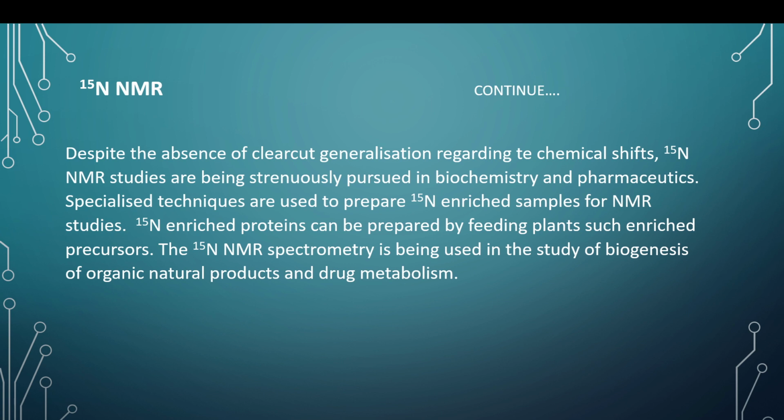Specialized techniques are used to prepare 15N enriched samples for NMR studies. 15N enriched proteins can be prepared by feeding plants such enriched precursors. The nitrogen-15 NMR spectroscopy is being used in the study of biogenesis of natural products, drug metabolism, and also in medical diagnostics, MRI.